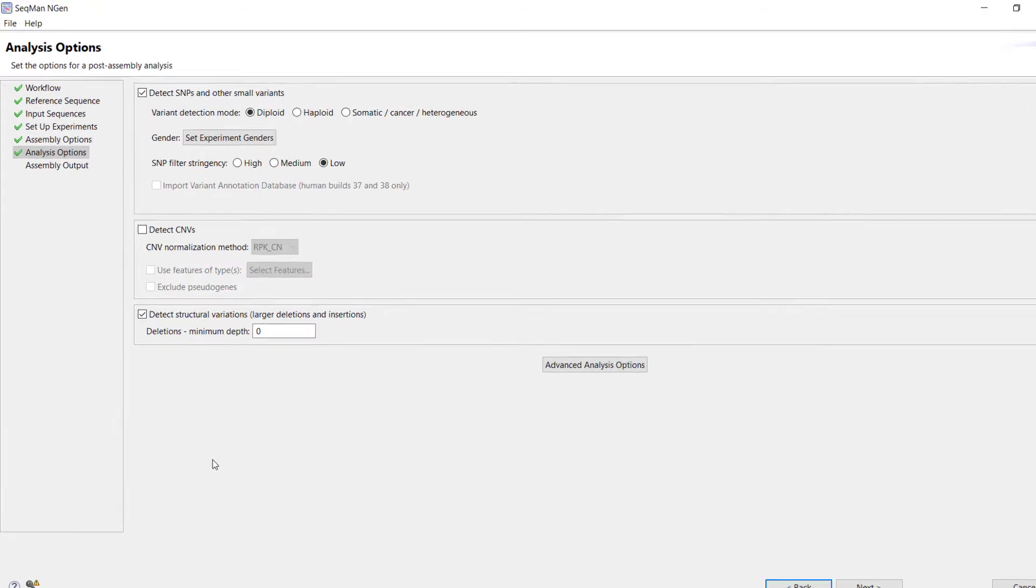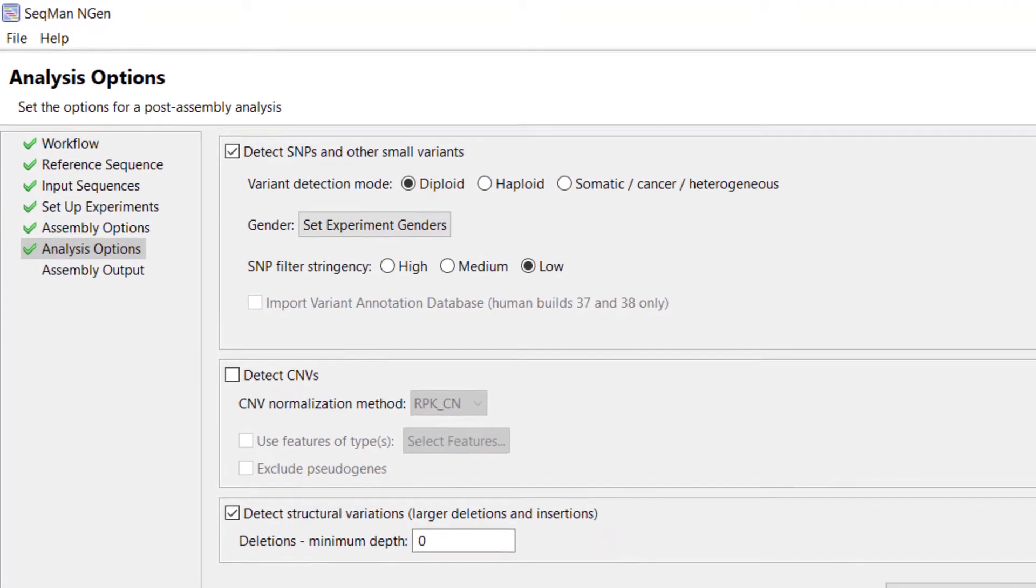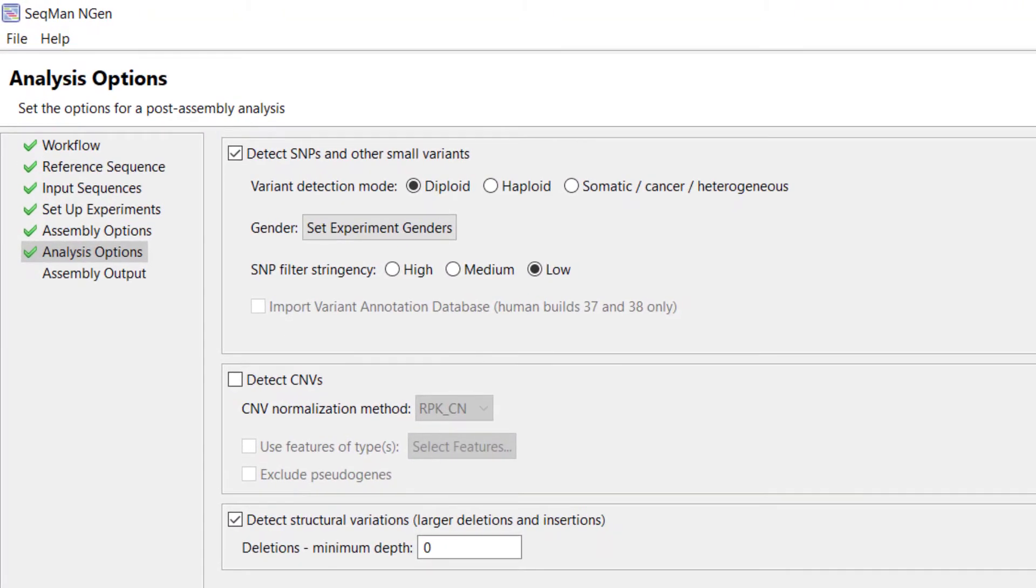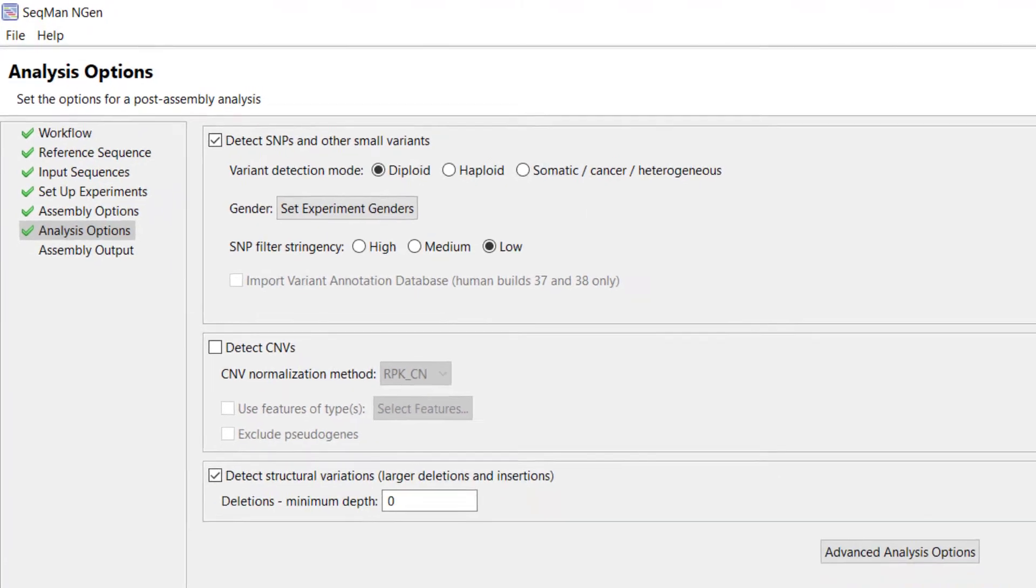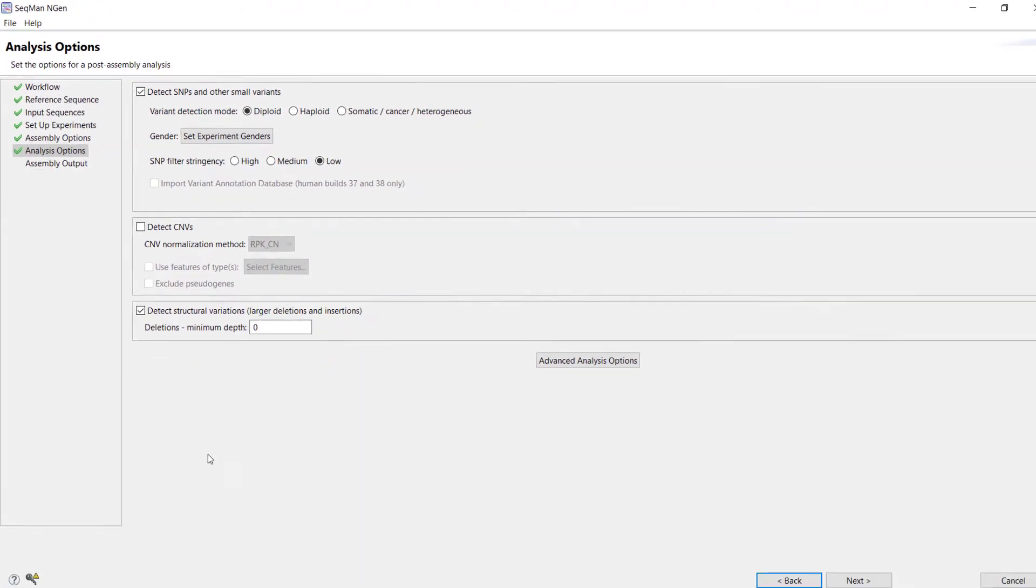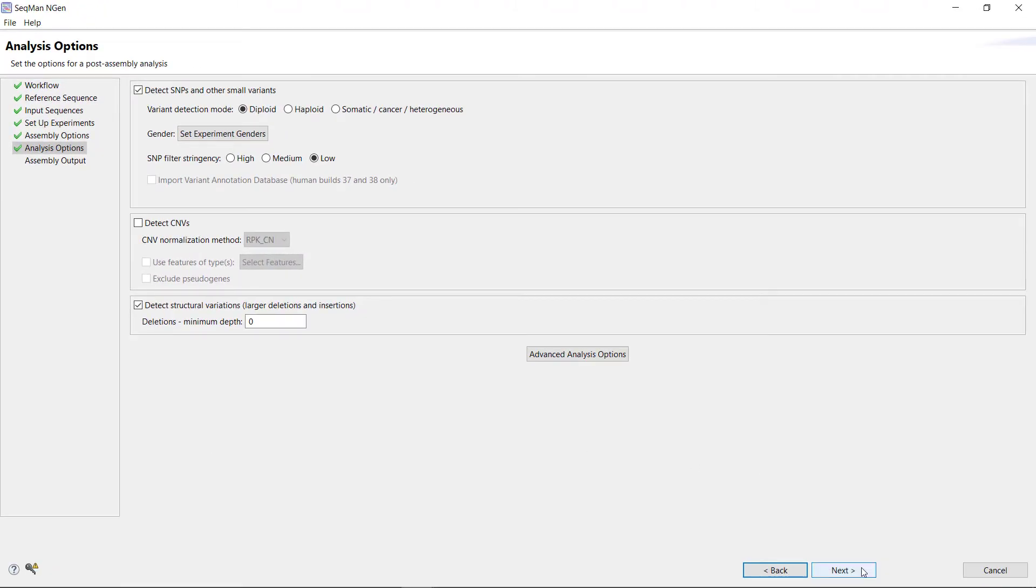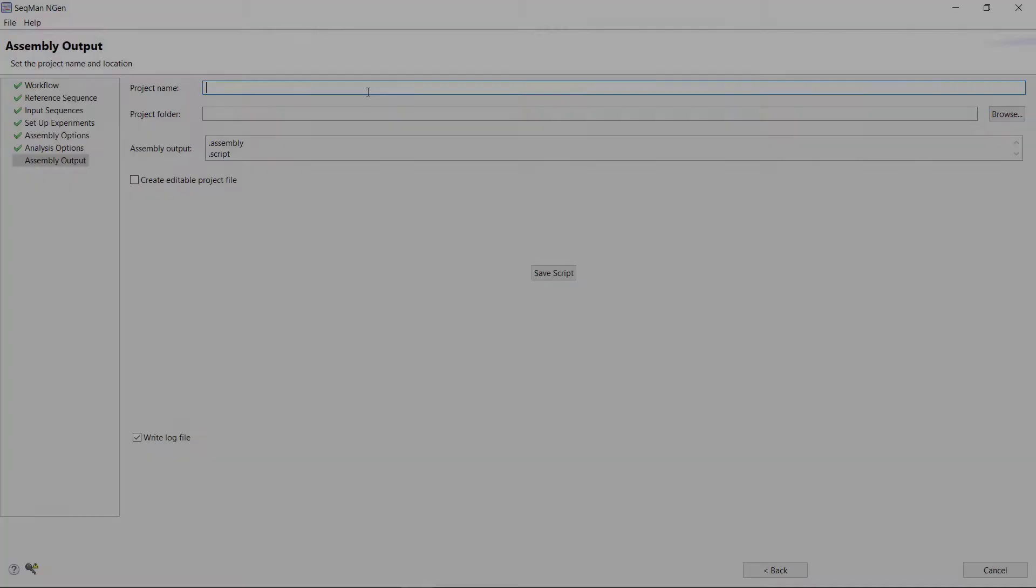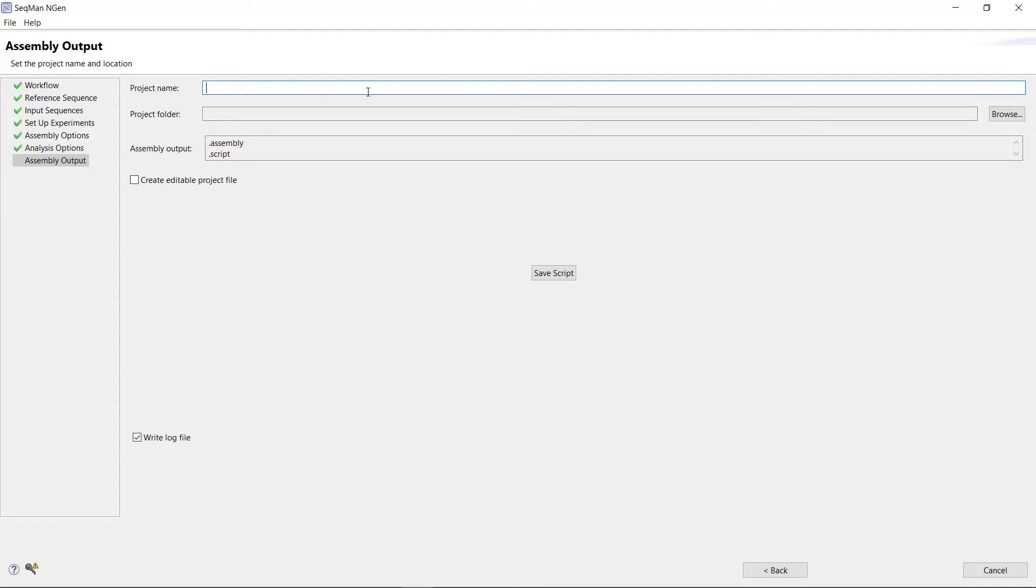In the Analysis Options screen, adjust SNP settings as needed, then click Next. In the Assembly Output screen, name your project and select a folder to save it to.